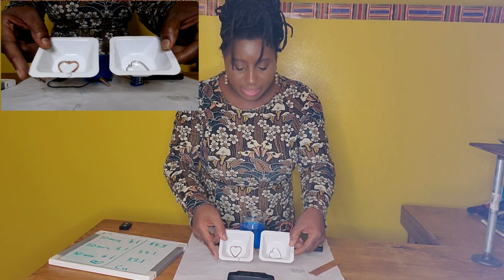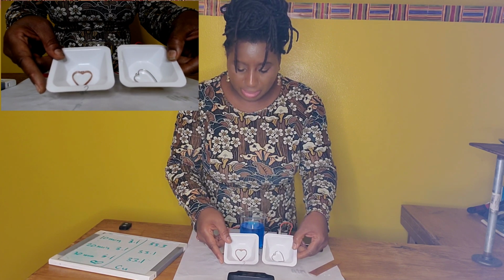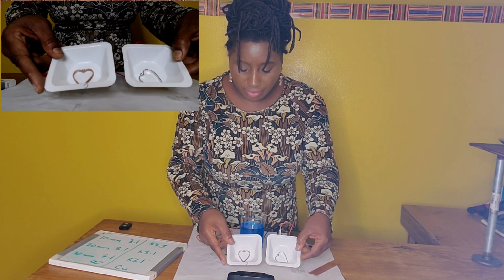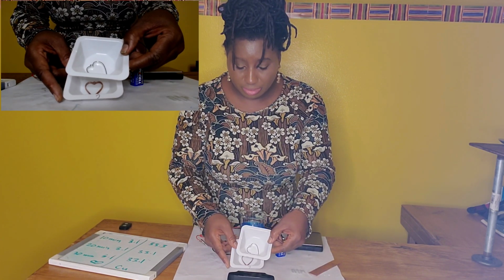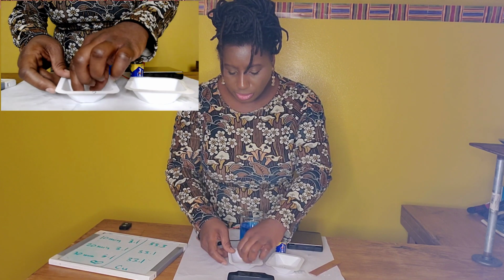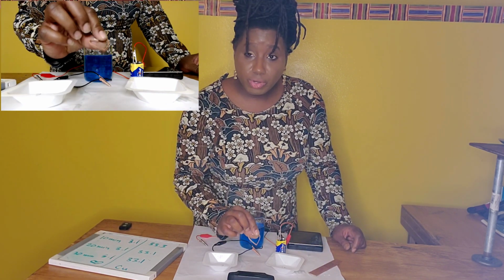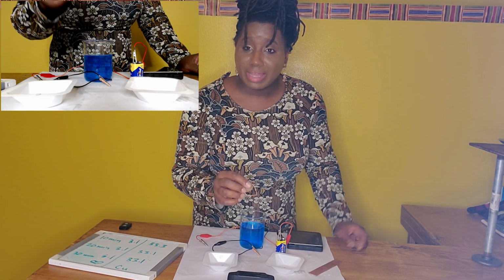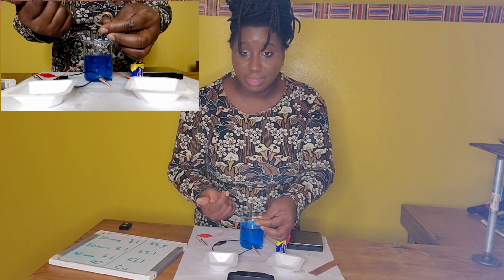Yes, absolutely. So now let's take a look at the plating of our heart-shaped pendant. I think we did a pretty good, decent job of plating the copper on the heart-shaped pendant. Here on the right, we have the copper-plated heart, and we have an unplated heart. I would suggest when you're plating your heart that you move your alligator clip so that the plating will appear on the tip where you place the alligator clip.